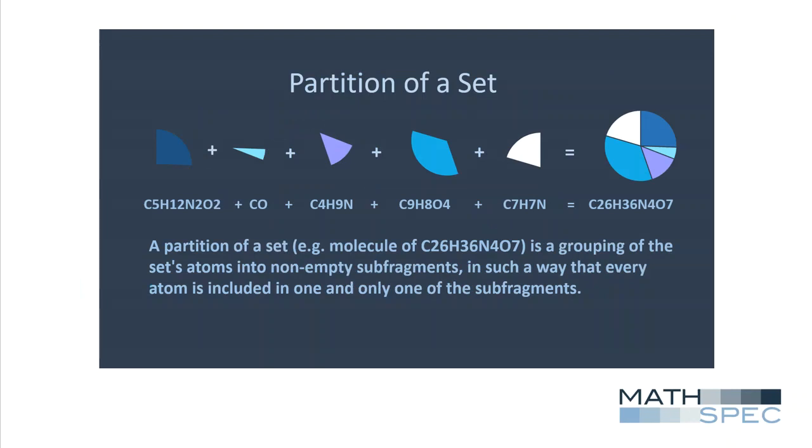The Excel add-in checks for sets of masses that sum up to the mass of the precursor molecule. These are called subfragment masses. This operation is very CPU intensive. The subfragment masses are then converted into subformulas, and then possible spatial alignments are also assigned based on logic. Now, with this approach, we're not working backwards from a possible structure. There are no fragmentation rules involved. We're trying to answer the question, what might the structure look like that produced this MSMS spectrum?